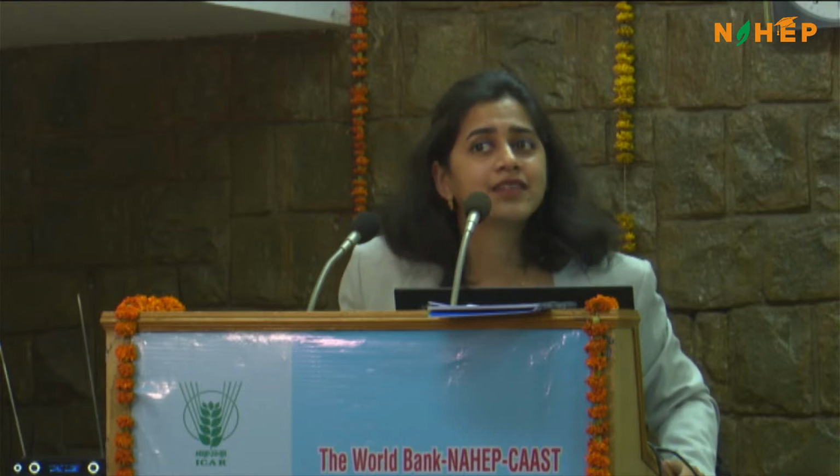Which organism it is? Pardon me? Okay. Then you can easily do it with Nanopore also. Long read technology can help you in sequencing it. And this repeat, if it is 30 bases repeats, they can sequence it, because they are sequencing the entire stretch. But if you're doing a SNP or anything, then Nanopore is not the recommended one. Like if you're trying to do any variation test or any other application, Nanopore has an error rate as well. So that has to be kept in mind, because it has an error rate of 7 to 8% at present. Okay, any more questions from anybody?